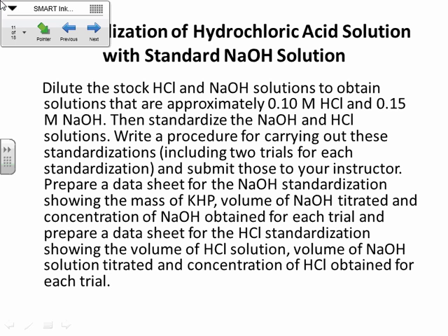You're probably not through part 2 right now. My guess is that you got the NaOH standardized. Hopefully you got that taken care of and you've got that set off to the side. We need to standardize your HCl probably on Monday, and then we'll see where we are after we get that done. Hopefully the titrations will run a little bit faster now that you kind of know what you're doing.